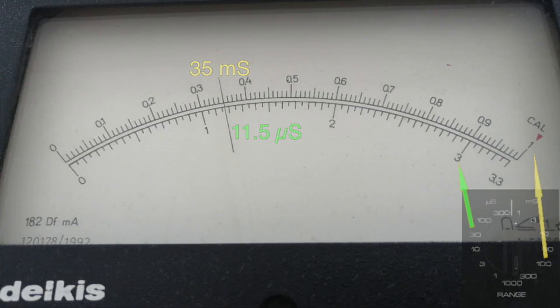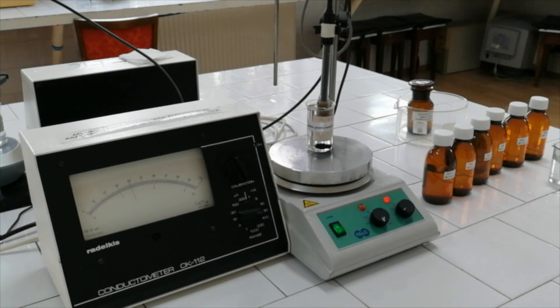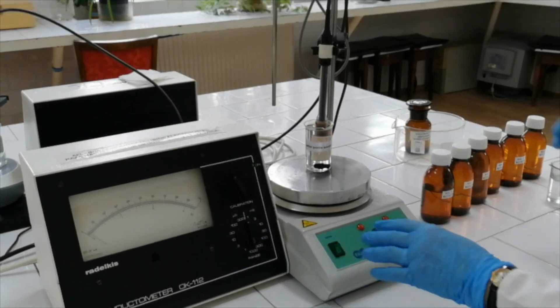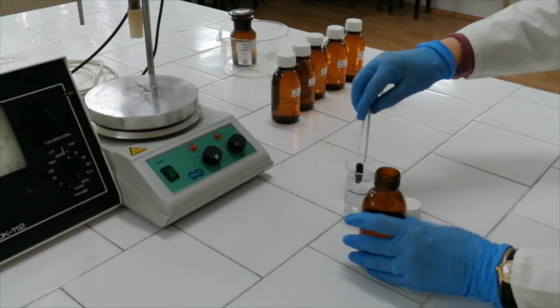Read the electrical conductance of distilled water 3 times and record the values in the table, expressing them in mS. Repeat the steps and measure the conductance of tap water, the 5 solutions of potassium chloride of known concentration, and one solution of potassium chloride of unknown concentration. After each measurement, don't discard the potassium chloride solutions — pour them back in their containers.